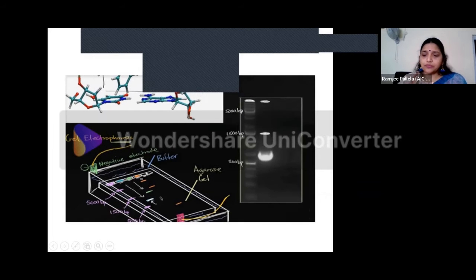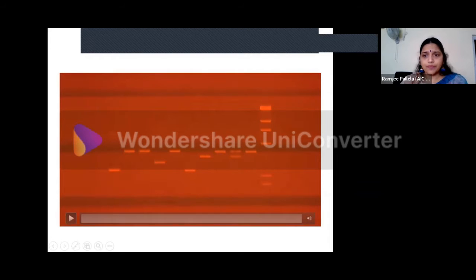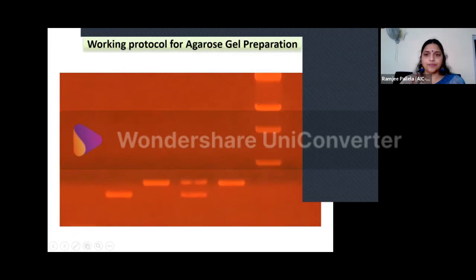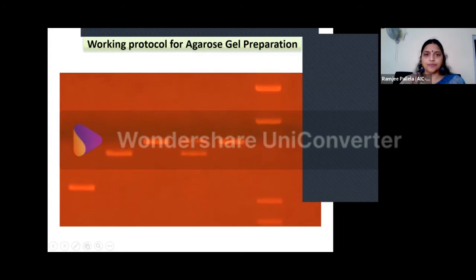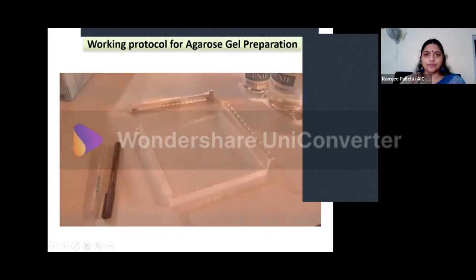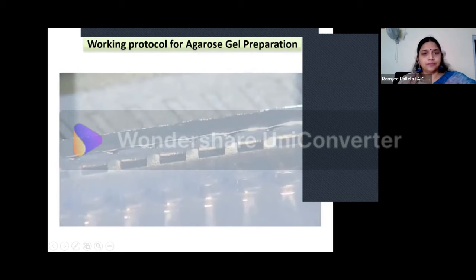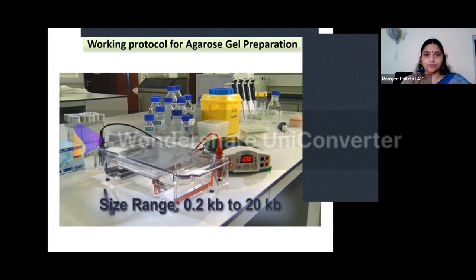Okay. Now let us see a working protocol. How do we actually work on gel electrophoresis? Agarose gels are used in molecular biology for the separation and purification of nucleic acid fragments. A dye is added so that the fragments can be visualized under ultraviolet light. The samples are loaded into the wells of the gel and separated by size using an electric current. The size range of fragments that can be separated using agarose is between about 0.2 kilobases and 20 kilobases.